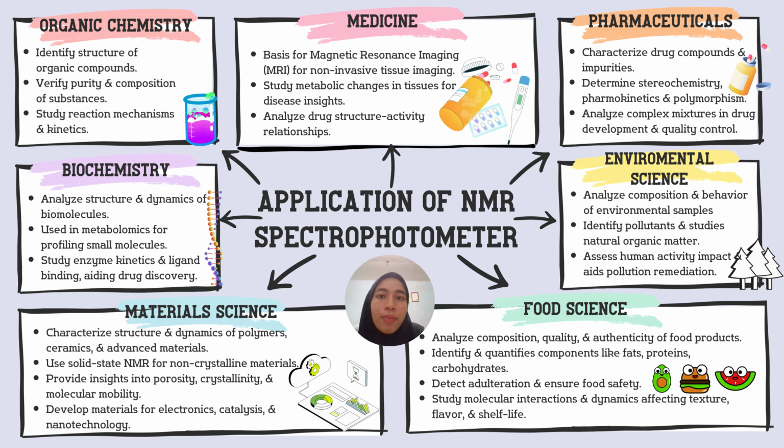Next, in environmental science, NMR analyzes complex environmental samples like soils, sediments, and water, identifying pollutants and understanding their interactions with the environment. It studies natural organic matter and its role in carbon cycling and nutrient availability, crucial for pollution remediation and sustainable resources management.